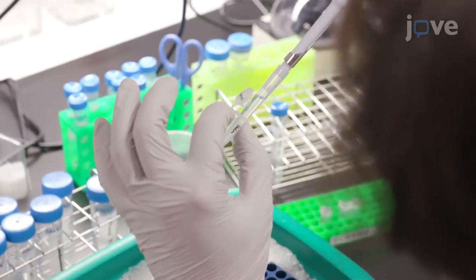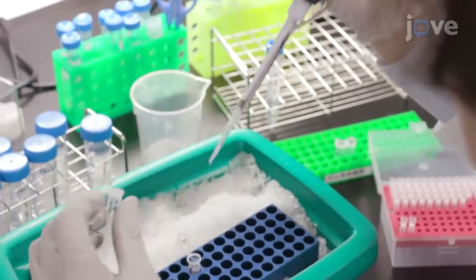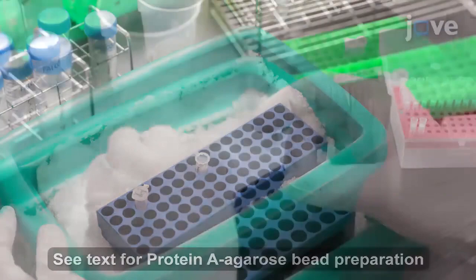Collect the supernatant and transfer 1 milliliter each of the supernatant into 1.5 milliliter microcentrifuge tubes. Pre-clear the lysate by adding 40 microliters of pre-washed protein A agarose beads per 1 milliliter of the lysate.